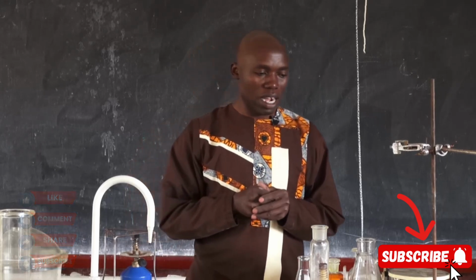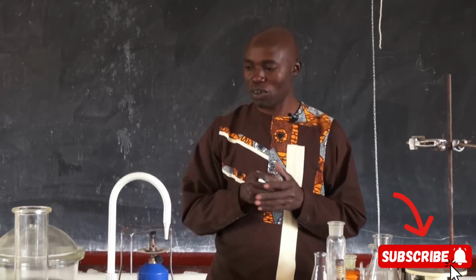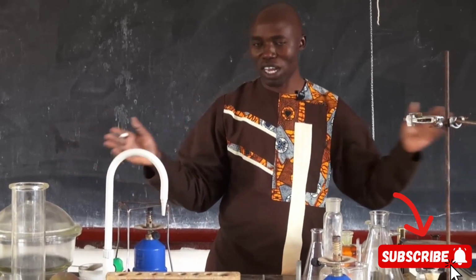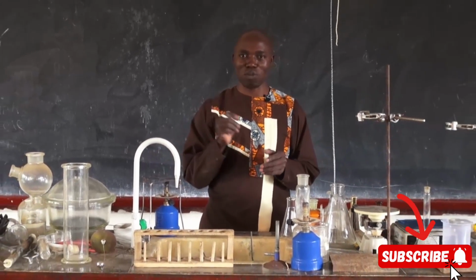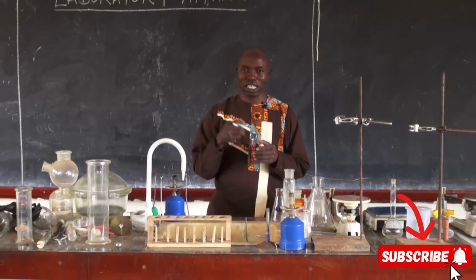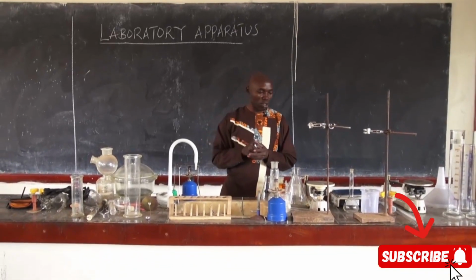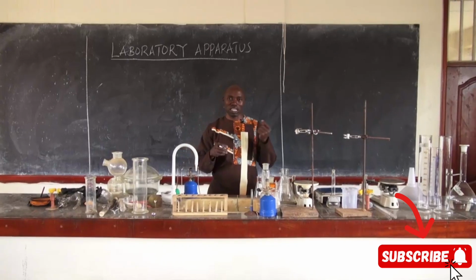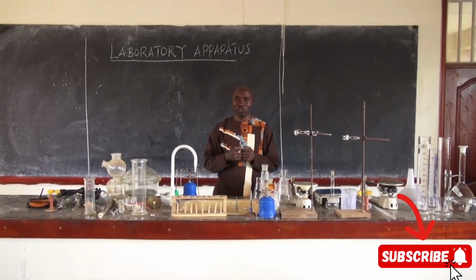Now, let me start over about laboratory apparatus. My table here you can see is filled up with various apparatus, so I'm going to take you through one by one its use, and some I'll demonstrate briefly how to use them, but not all because time won't permit in this discussion. Maybe we can have another video where we are seeing how each is being used.